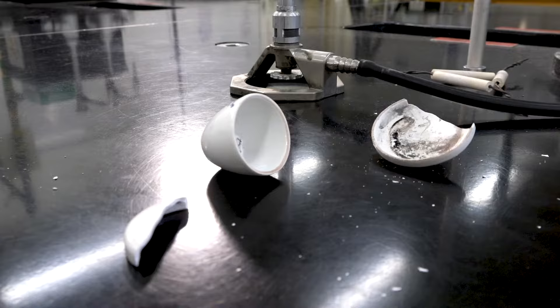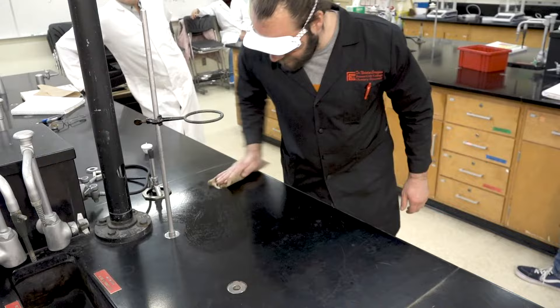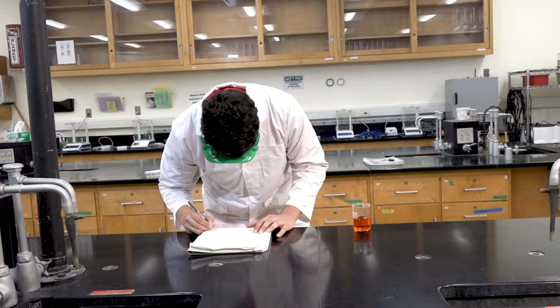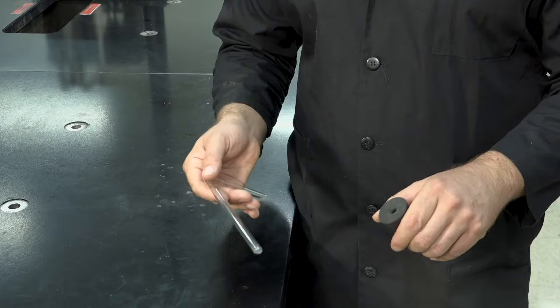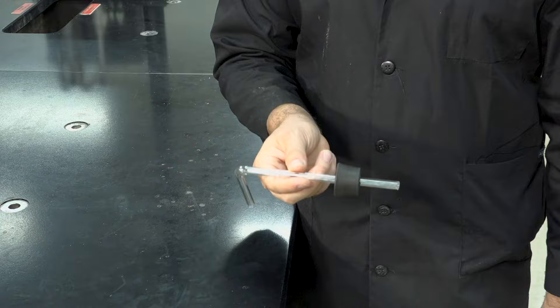The most common accident in a chemistry laboratory is broken glassware. While breaking glassware is an unfortunate fact of life in any chemistry lab, there are some important steps we can take to minimize its occurrence. Always place glassware at the center of your bench space when not in use, instead of at the edge of the bench where it can be easily knocked off. For more thin and delicate instruments, do not apply an excessive amount of force. If something feels stuck, ask your instructor for help rather than applying more force.